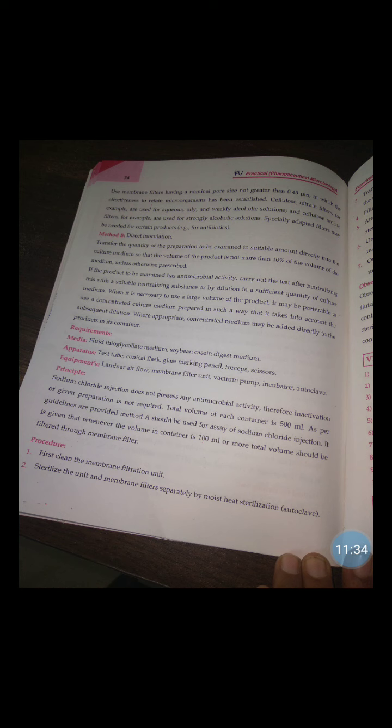The sodium chloride injection does not possess any antimicrobial activity. Therefore, the inactivation of the given preparation is not required. The total volume of each container is 500 ml. As per the guidelines provided, method A should be used for assay of sodium chloride injection. It is given that whenever the volume in the container is 100 ml or more, the total volume should be filtered through a membrane filter. Then we will see the procedure.